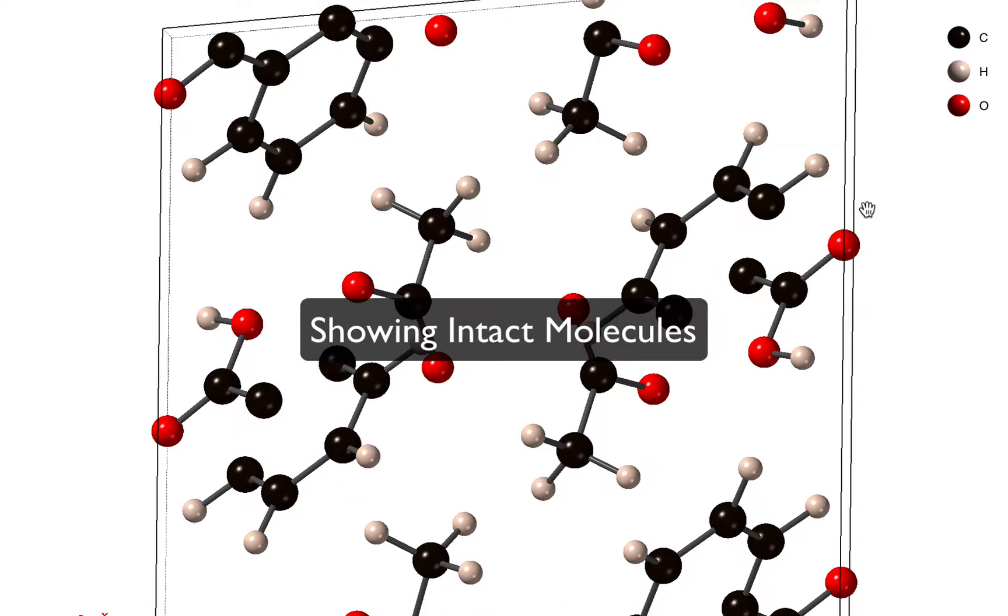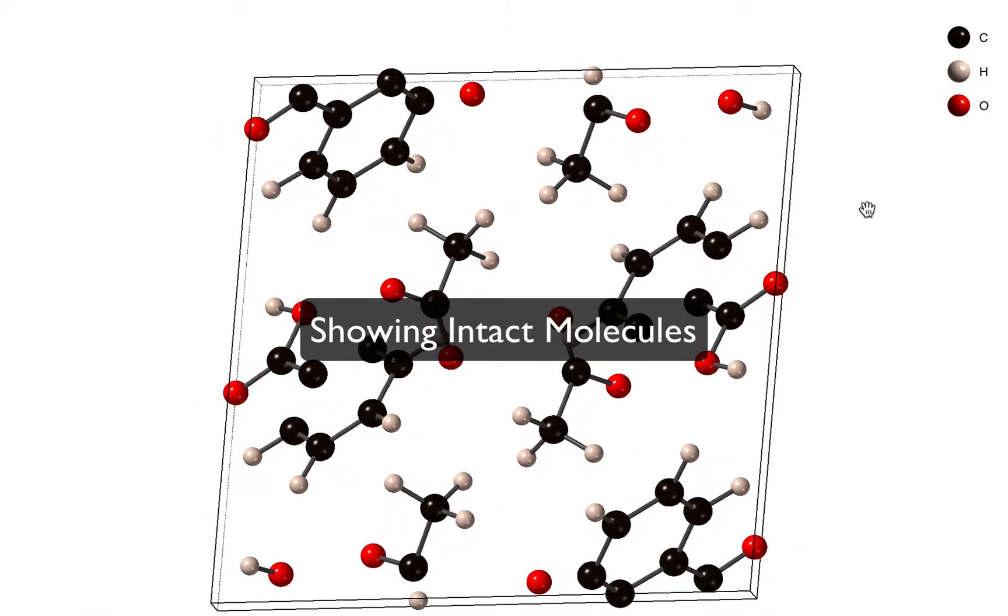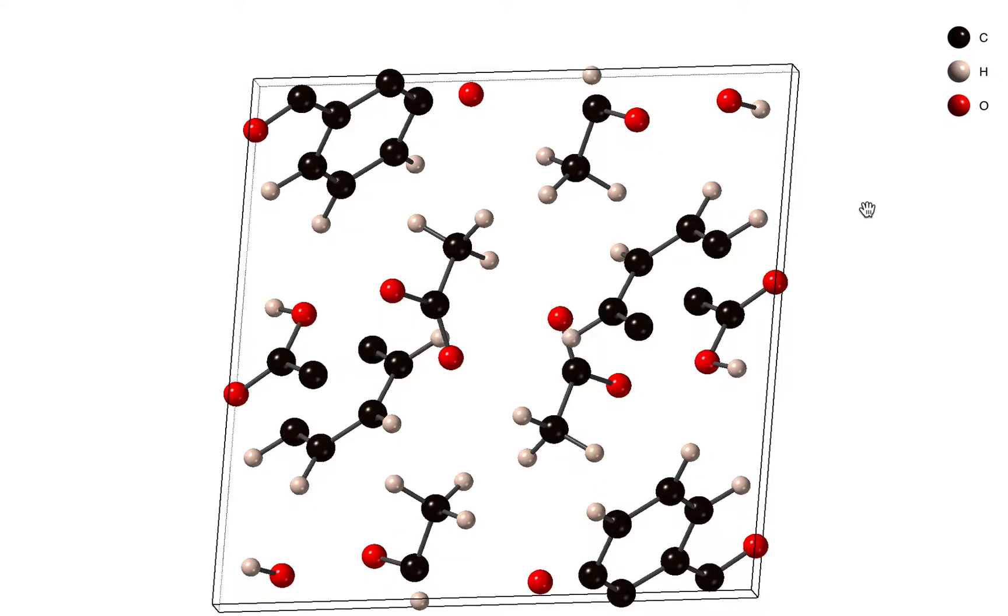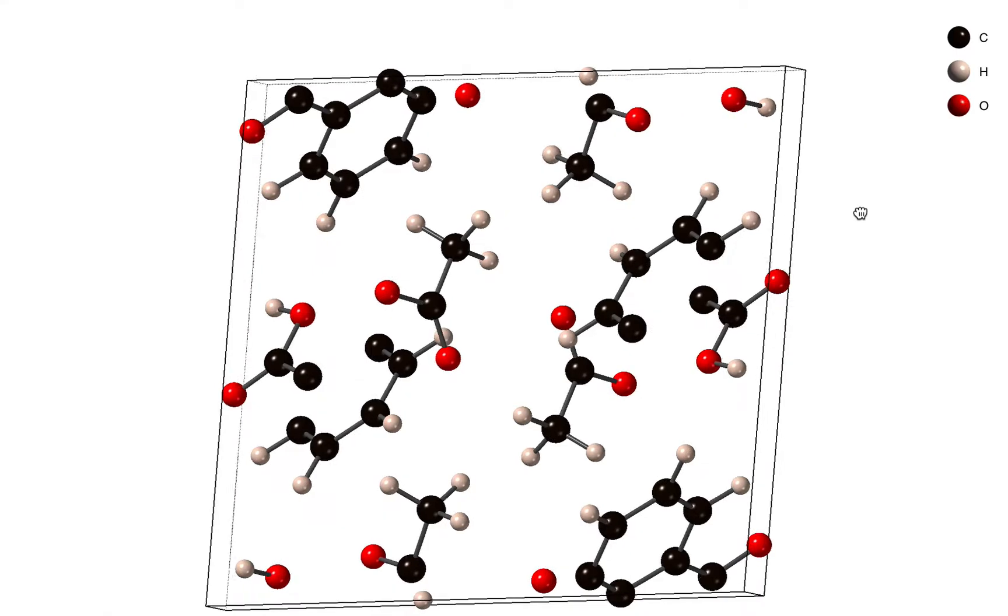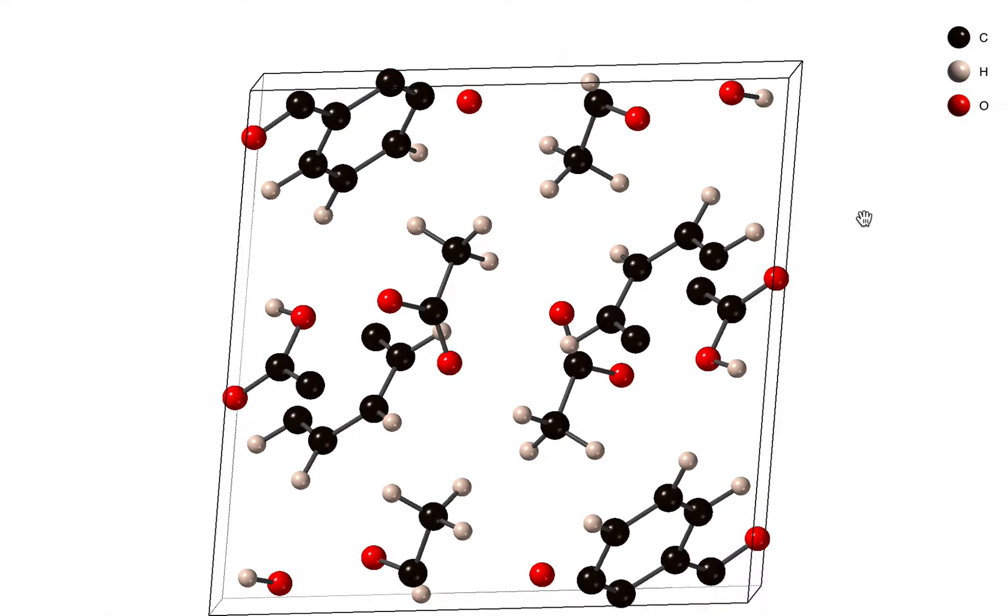Now the next thing we need to do is try and tidy up this mess of the unit cell. It's very easy to repair fragments, but we have some automatic commands to do that as well.